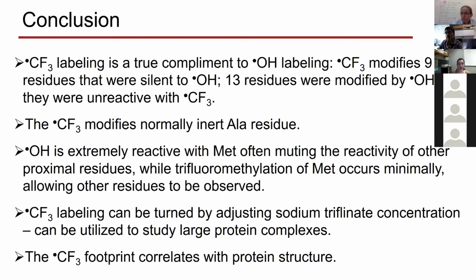Hydroxyl radicals are also extremely reactive with methionines and often mute the reactivity of residues proximal to methionines. By trifluoromethylation, we modify methionine really minimally, allowing residues near the methionine to be observed and analyzed. Also, CF3 labeling can be tuned by adjusting sodium triflinate concentration, the same as GEE and EDC chemistry, if you remember.